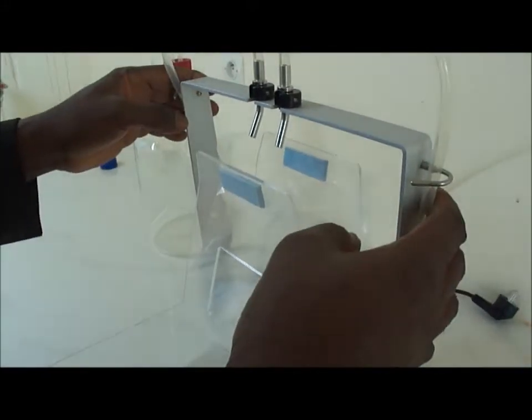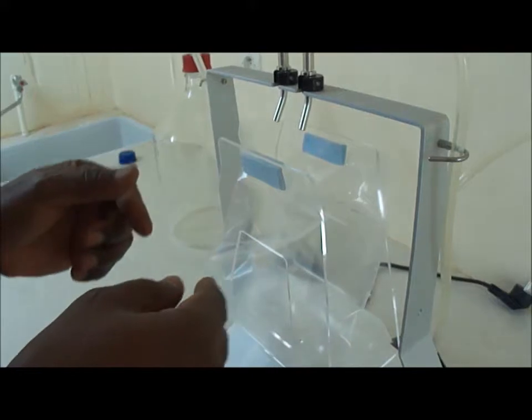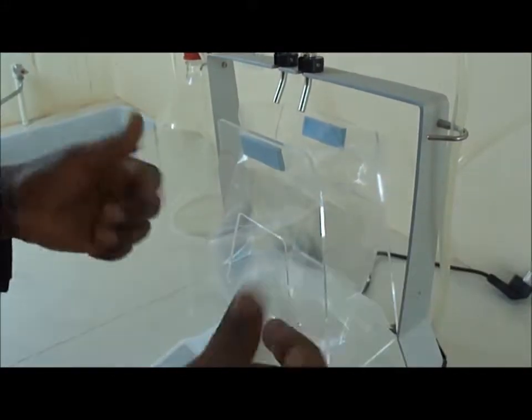And if it's in this position, then according to the dilution factor, the diluent is pumped and mixed with the sample.